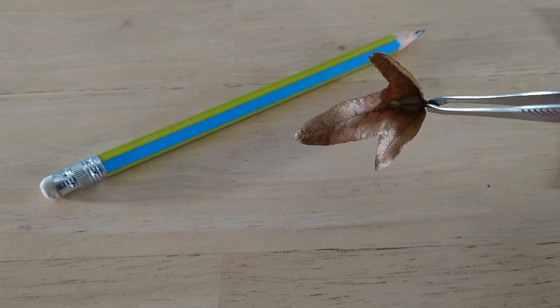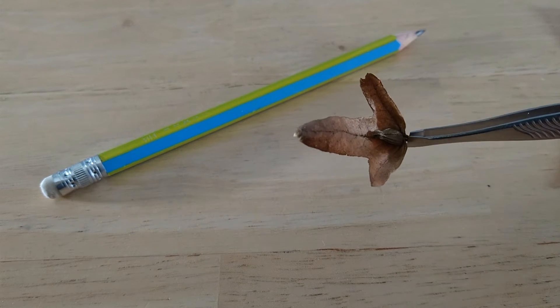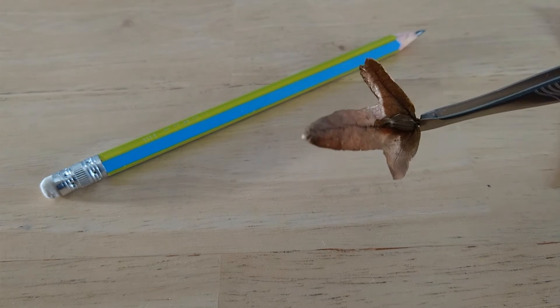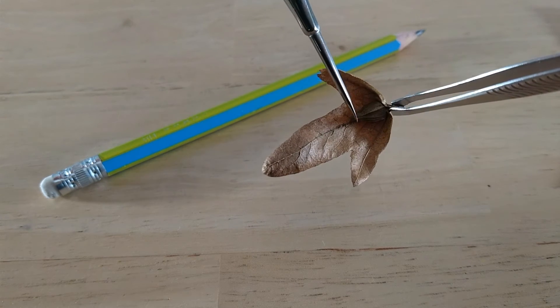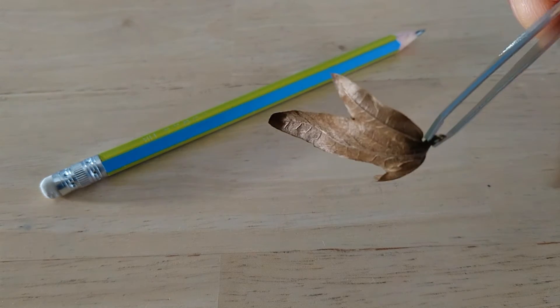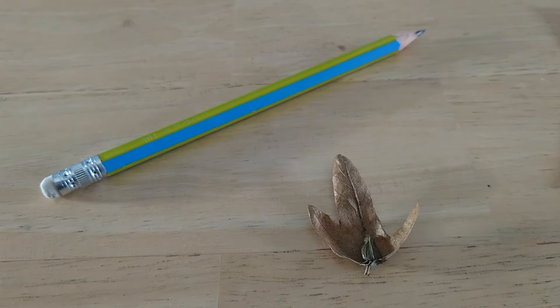Here you can see we have a lot of veins still visible on the leaf. This part up here — that is the seed, I would assume. I'm not a biologist, so no idea what it is exactly, but I'm definitely sure we want to look at it under the microscope now.